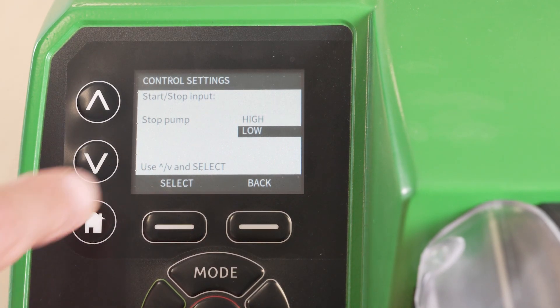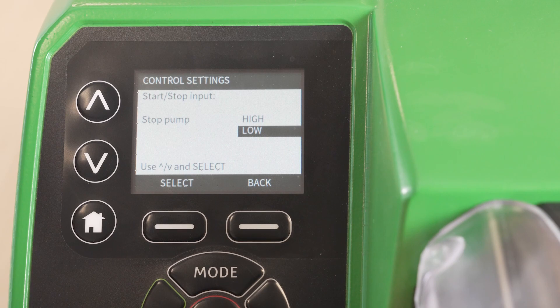This means that if the control signal is low — sometimes known as logic zero or off — then the pump will be stopped. This selection means with nothing connected the pump will not run due to the low input. If the input sense is set to high, then it will need an appropriate voltage applied to the pump in order to apply the control action to stop.